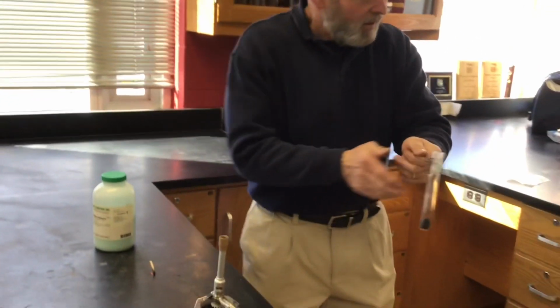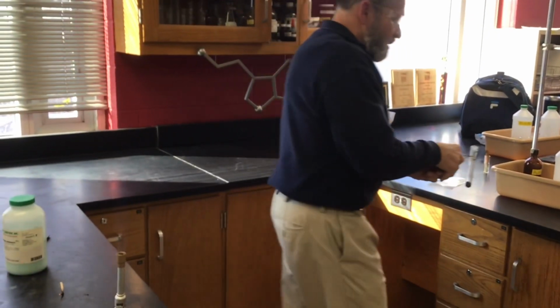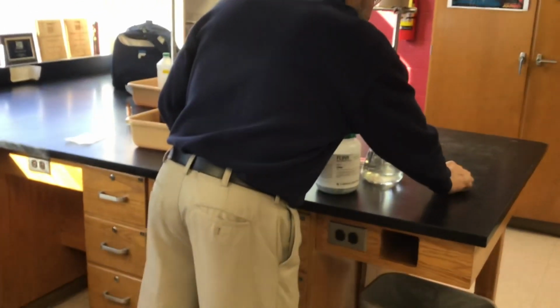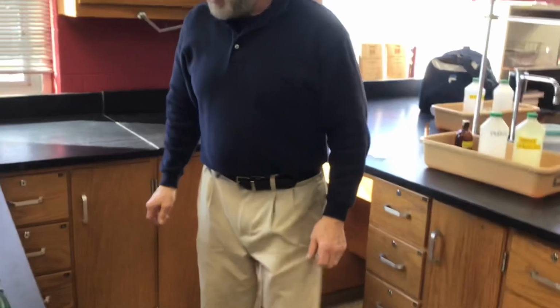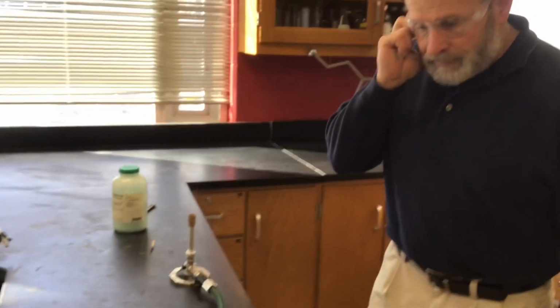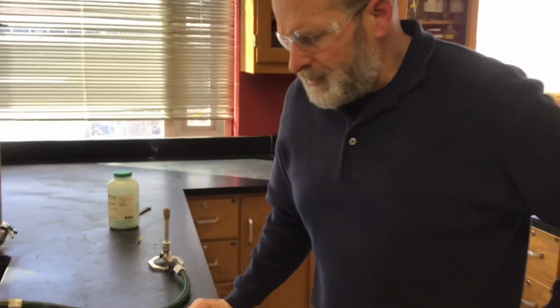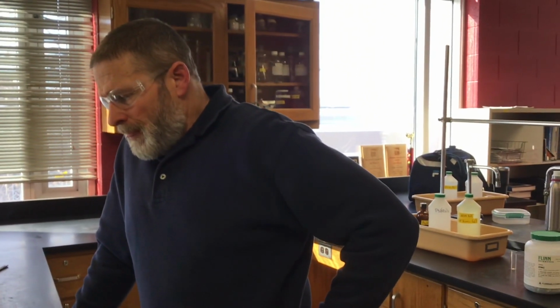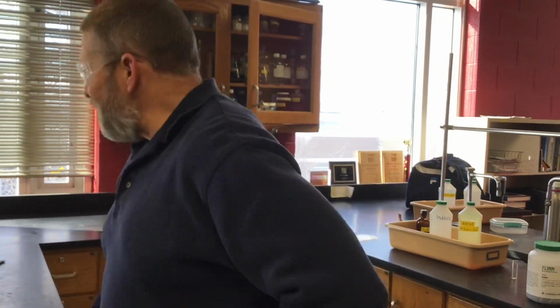Okay, so that was step 2. This is a little hot. You just go ahead and set that down on the tabletop. Let that cool off. Good. Okay, so let's leave that burner on again. We have step 3. It's a little different. Step 3 is to take a piece of zinc metal, and we're going to add it to a test tube, and then we're going to add some hydrochloric acid to it. Okay, so let's get that going.